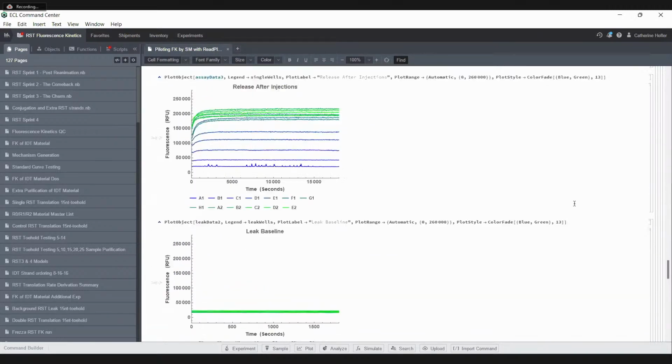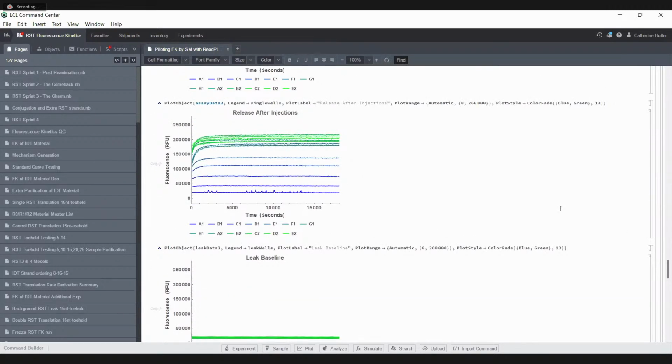Hold on. So this is over the course of many hours. Correct. This is so that some reaction is slowly happening that is changing the amount of fluorescence in your sample. Correct. Okay. All right. I'm just trying to, yes. Okay. Please go on. Yeah.